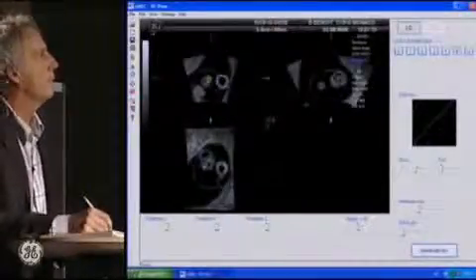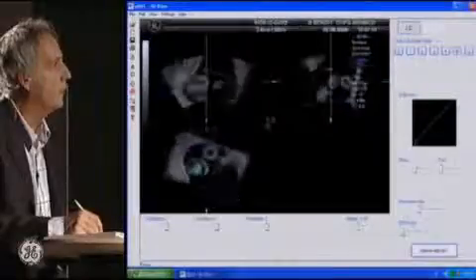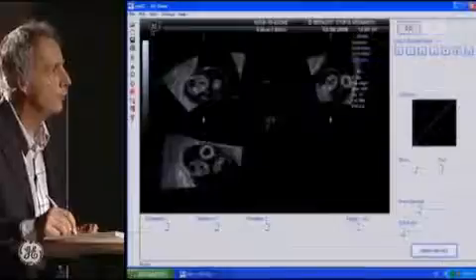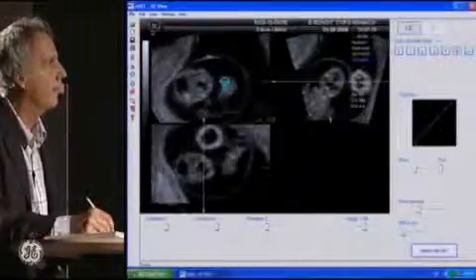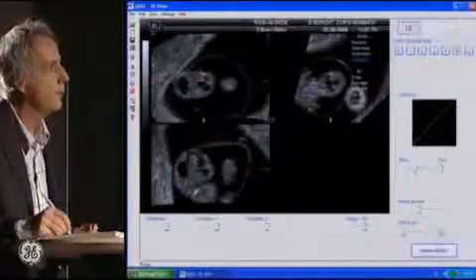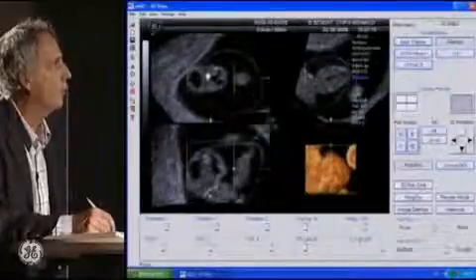This is one embryo, the brain of an 8-week embryo. I will show you how to obtain the brain cavities with inversion mode. First I play magnify. You put the head inside the rendering box here.